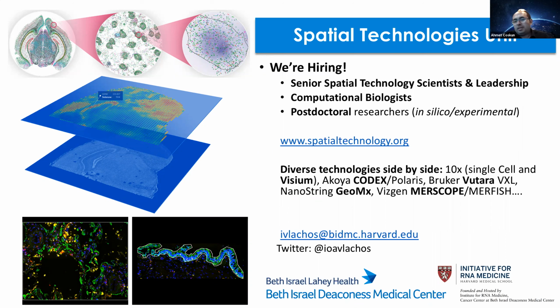So you talked, in the meantime, maybe I can ask a few questions. You talked about normalizations, right? So the capture efficiency of all these machines and technologies are different. Do you also take into account those as well? Capture efficiencies and the readout differences?